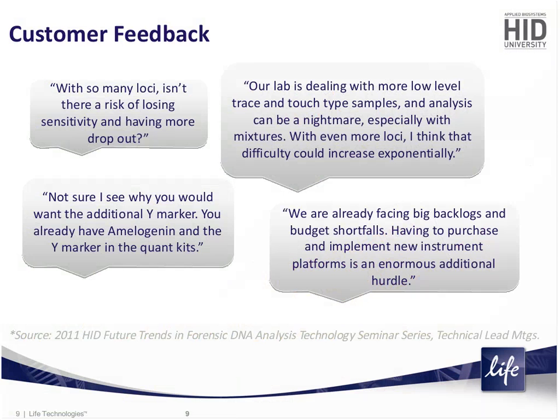Probably one of the most common concerns was that with so many loci, isn't there a risk of losing sensitivity and having more dropout? This is obviously of concern to laboratories because in recent years we have been able to improve the levels of sensitivity and decrease the levels of dropout that laboratories see. And of course they don't want to go back to the days of only getting poor quality partial profiles from some of their most difficult samples. So maintaining the levels of performance we've begun to see over the last few years is obviously of paramount importance.